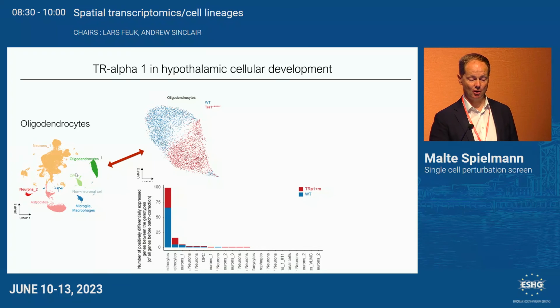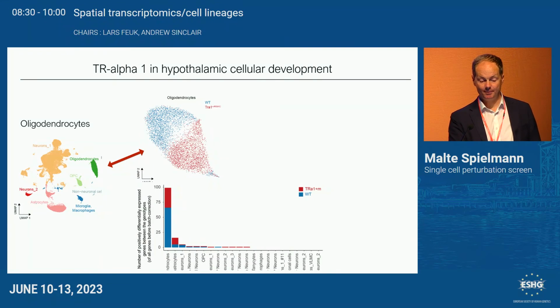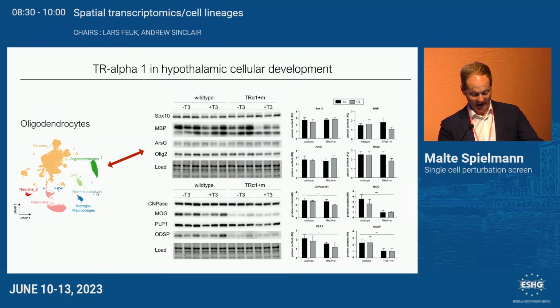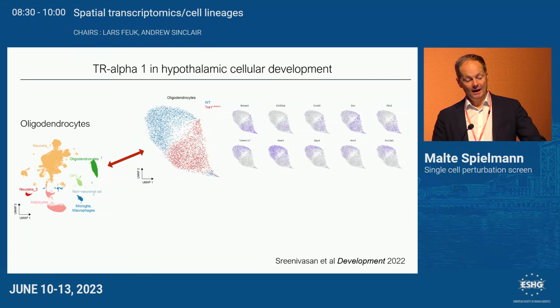And so when we subclustered the oligodendrocytes, we actually found a very interesting phenotype, seeing that there was a complete separation between wild type and mutant cells. So what does that mean? That means that there are oligodendrocytes, but they behave completely differently. So they express different genes. And so we were very surprised. And you can then ask the computer to show you some of those genes. So these are the majorly differentially expressed genes. And Jens and his team actually then validated this using conventional technologies. And what's the takeaway from this? I think, and this is one of the strongest things about phenotyping using RNA sequencing, this will show you phenotypes that you never even thought about.